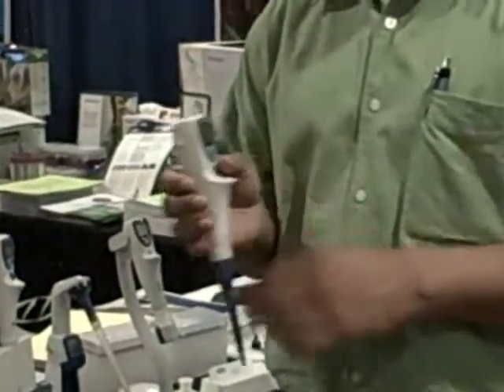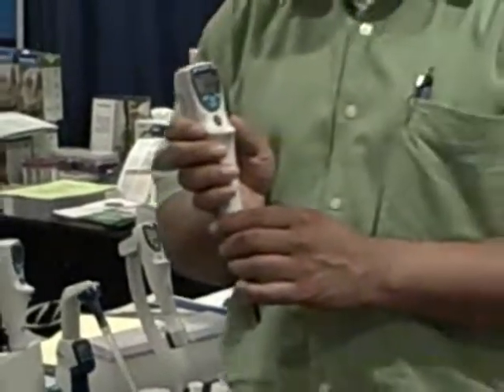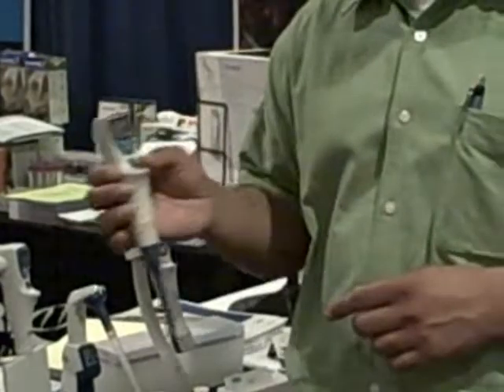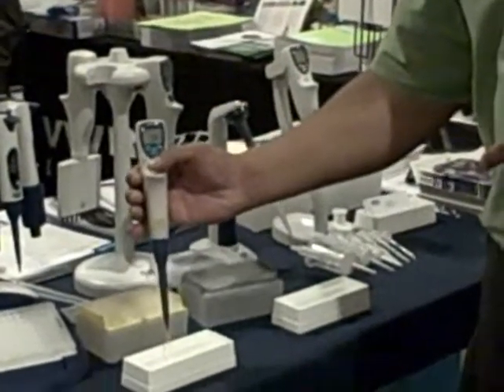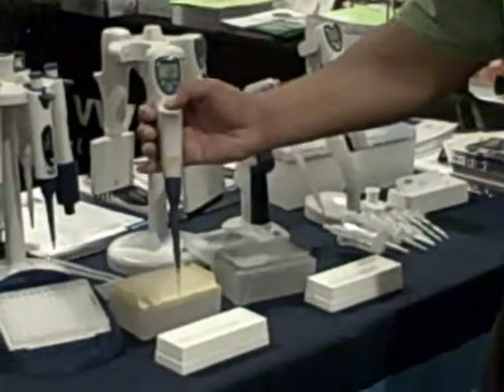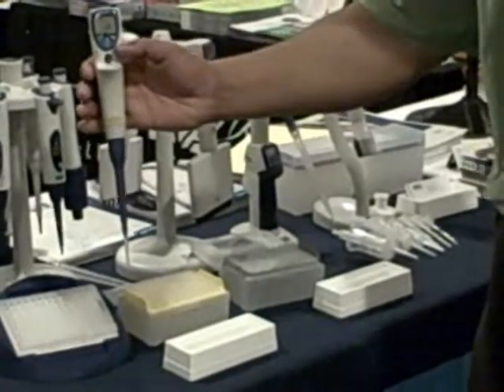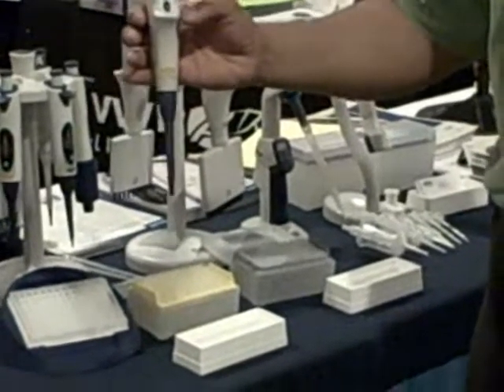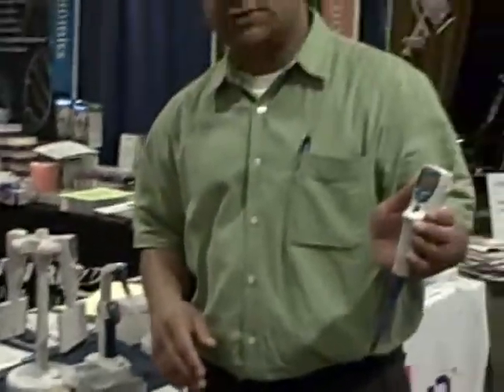BioEd is focused on ergonomic design. We're the only manufacturer right now that does have an electronic tip ejection. So basically you put on your tip, draw up your sample, dispense your sample. When you're done, there's buttons on the side that easily eject your tips, and this pipetter can be used both for right-handed users as well as left-handed.